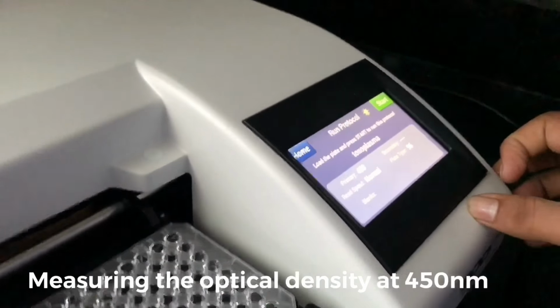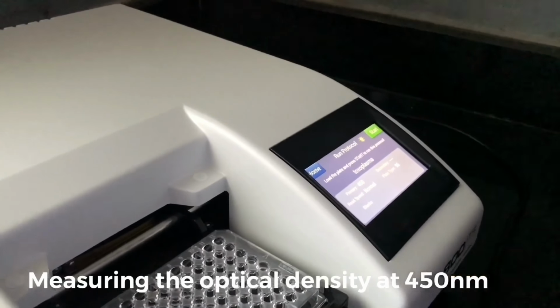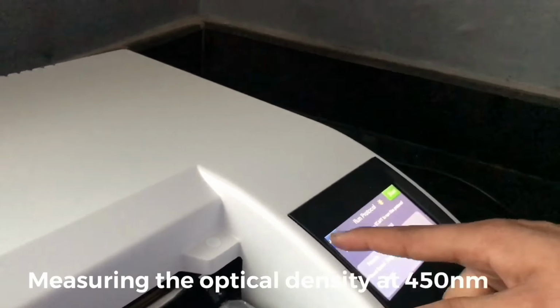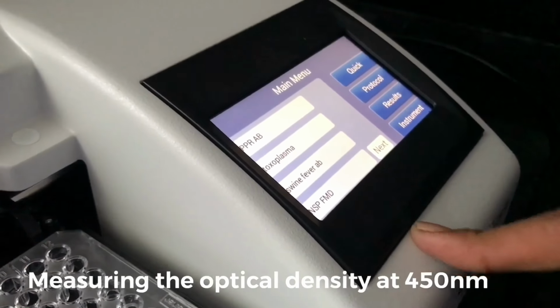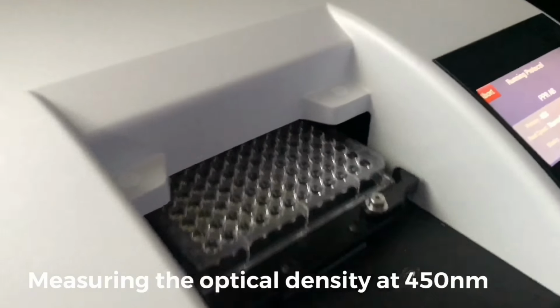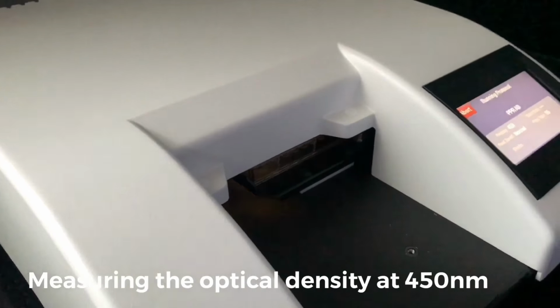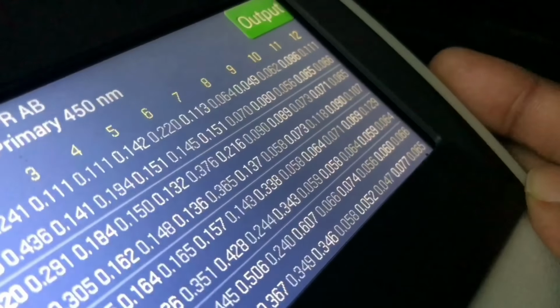Just keeping the plate and setting it to PPR antibody. We are doing the test for PPR. So just starting. The reading is like this. It will show the optical density of each compartment, each well. So we can transfer it into Excel.